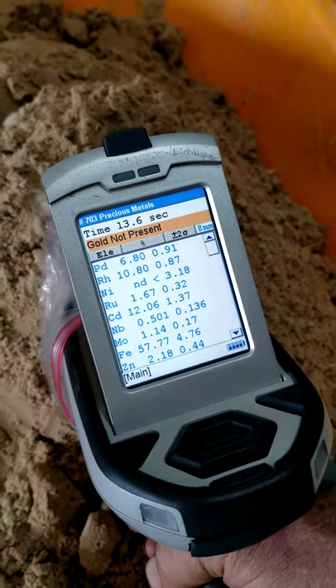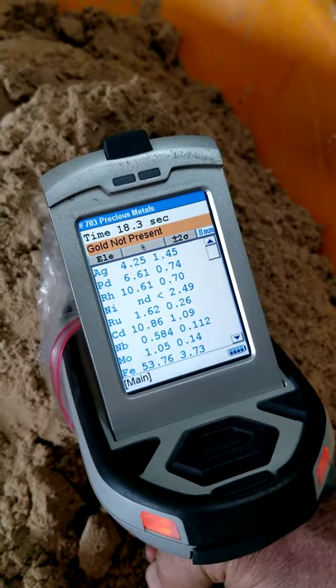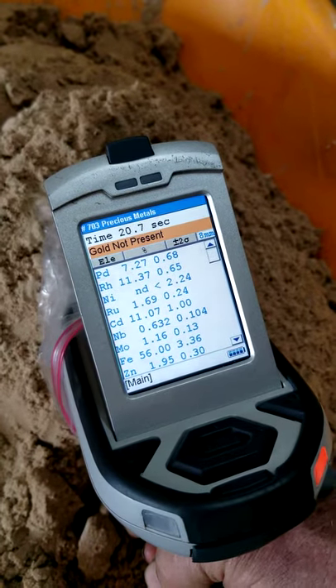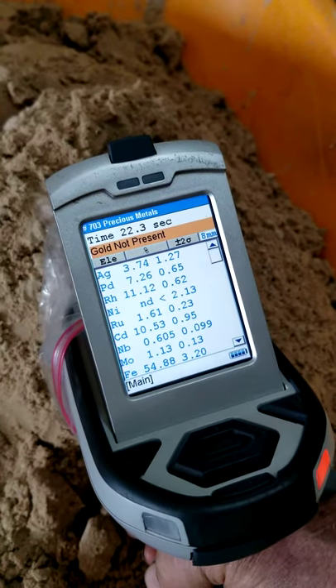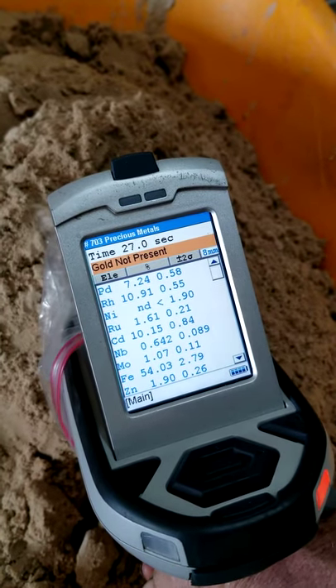Now you're seeing things popping up — the PD is palladium, the AG is silver. We very rarely test the raw ore, but we normally have some indicators that there could be other precious metals in it.